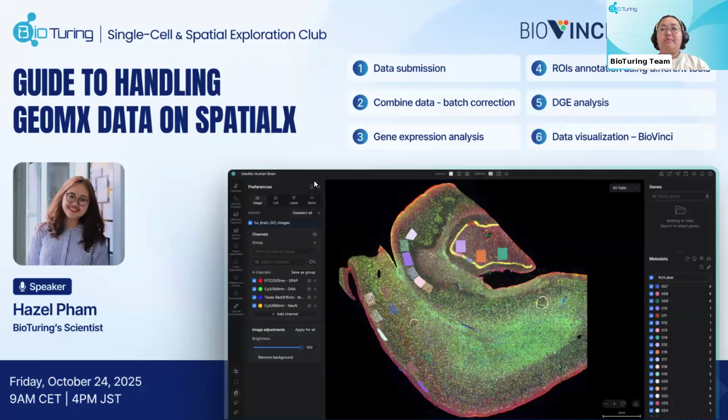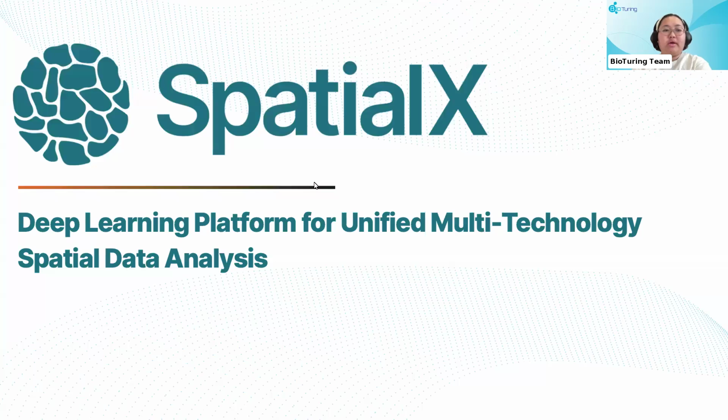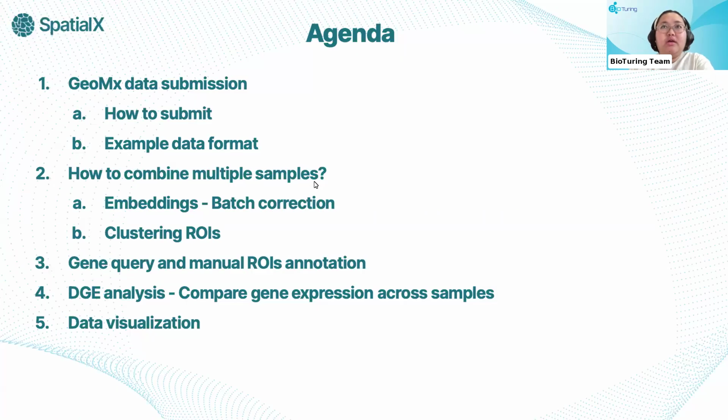Okay, so now let me go ahead with the quick introduction of the agenda today. As I just mentioned earlier, we'll go through the best practice of how to handle GeoMx data, from submitting the data, combining the data, and performing some of the downstream analysis and visualizing the data as well.